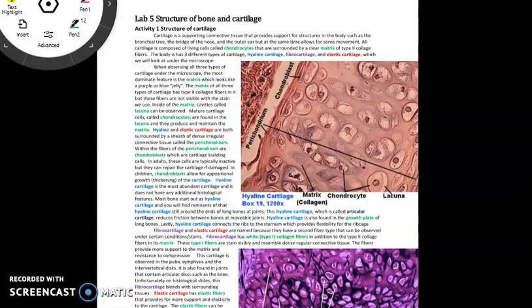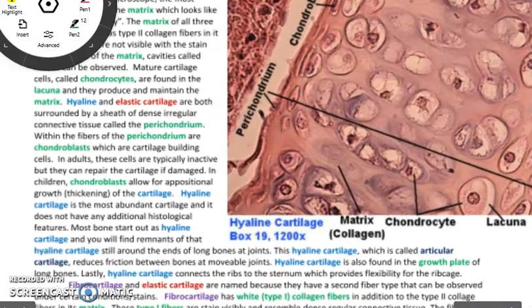And I want you to also include something that will help you identify it on the lab exam, which type of cartilage it is. So not the textbook, elastic cartilage has elastic fibers. What would help you? I tell my students it's cheating to memorize. Elastic cartilage is purple with lots of black lines in it. Completely cheating. But that actually helps them a lot.